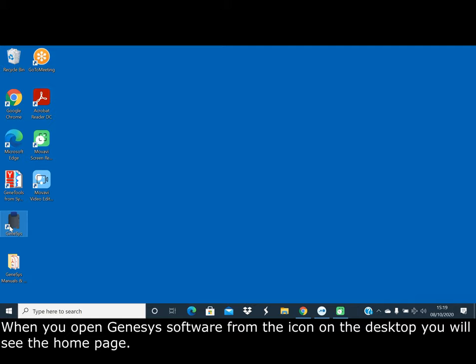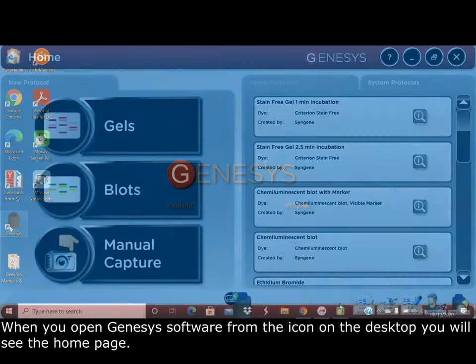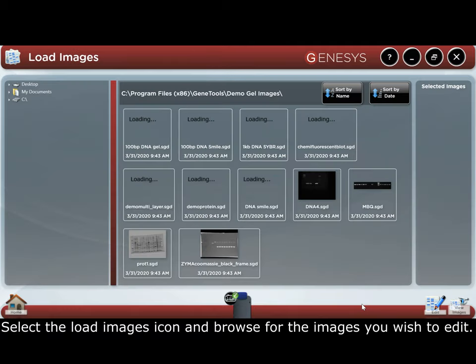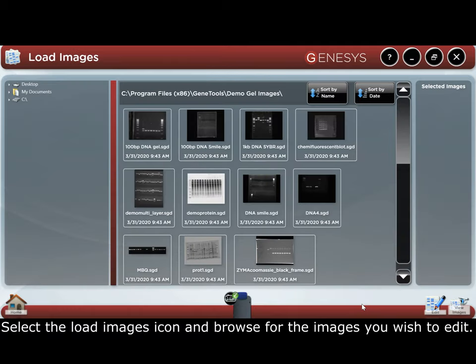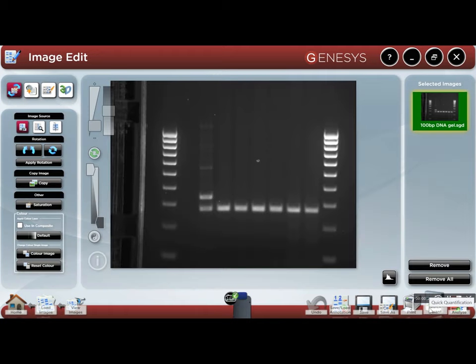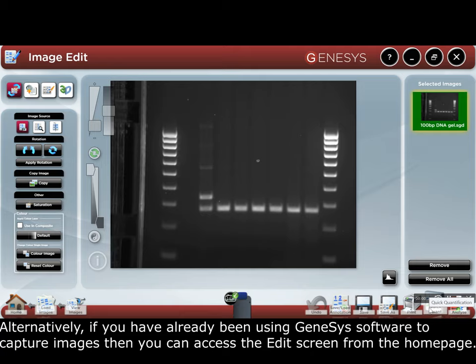When you open Genesis software from the icon on the desktop, you will see the home page. Select the Load Images icon and browse the images you wish to edit. Alternatively, if you've already been using Genesis software to capture images, you can access the edit screen from the home page.